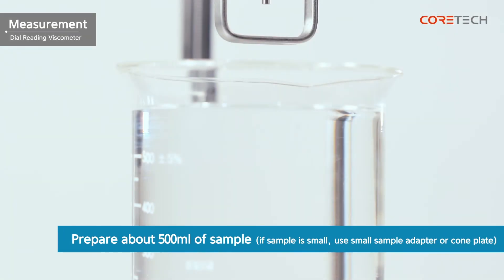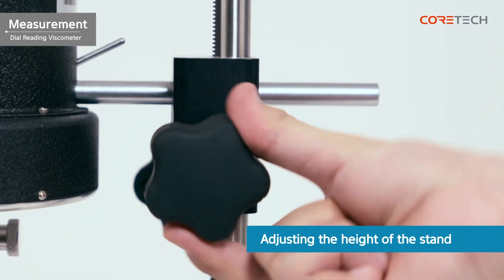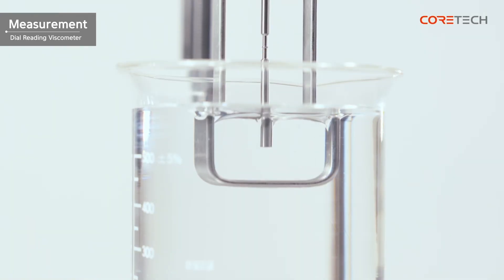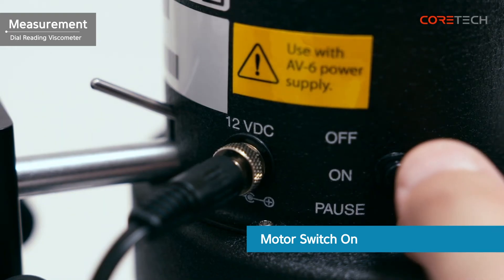Prepare approximately 500 milliliters of sample for measurement. If it is difficult to secure 500 milliliters of sample, you can measure it using a small sample adapter. Turn the height adjustment knob on the right side of the stand and immerse the spindle in the sample to the groove shown on each spindle. Set RPM using the speed control dial at the top of the viscometer, then position the motor switch to on.